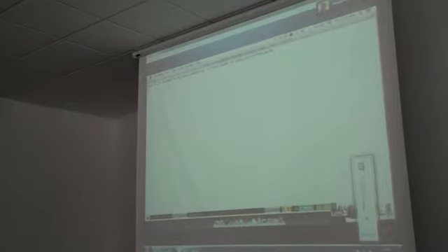That's going to take just a second to run. So this biom file now is going to exist. It's just another OTU table that's been normalized by the 16S copy number. Hopefully it's fairly quick here. Okay, so now that's done. If we look now, we have a new OTU table as well.